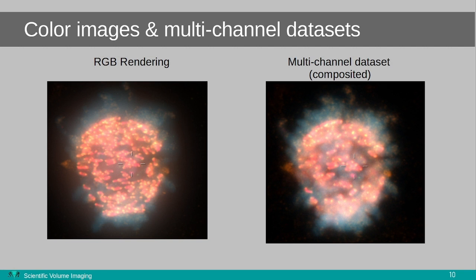A fluorescence microscope uses multiple fluorophores or multiple channels, and here we are not as interested in how the summed intensities of all fluorophores add together break down into specifically red, green and blue components. We are mostly interested in the total intensity of one fluorophore compared to the total intensity of another one.